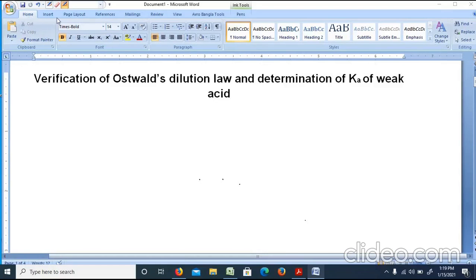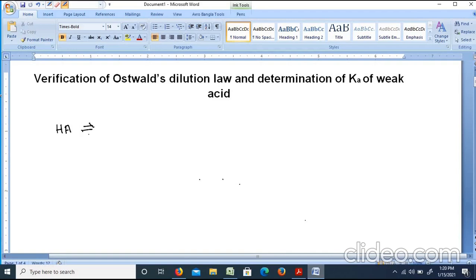Today we have done the experiment of Ostwald's Dilution Law and Determination of Ka of Weak Acid. We know that the aqueous solution of weak acid, for example acetic acid, is partly ionized. This is the generalized equilibrium we have to represent, where the equilibrium involves HA dissociating into H+ and A-.